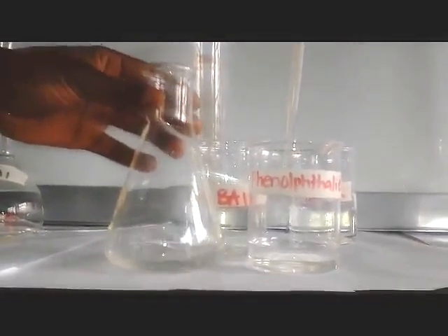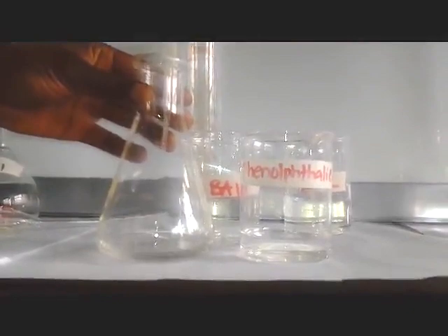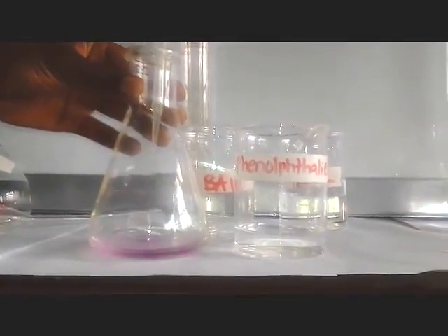Then the man is saying, add 3 drops of phenolphthalein indicator. That is procedure number 2. Then I get my phenolphthalein indicator. It is my phenolphthalein indicator, colorless as it is, as we said. Then the man is saying, add 3 drops. Then you get your dropper. You suck a bit like that from the phenolphthalein indicator. We add it to the solution which you have pipetted. This is our solution which you have pipetted. Then we come and we add, that is it.